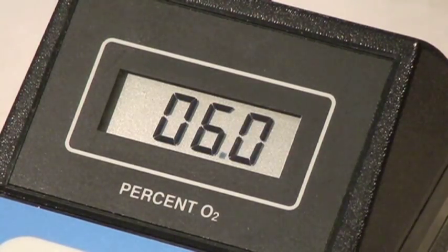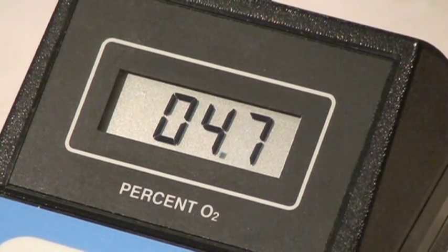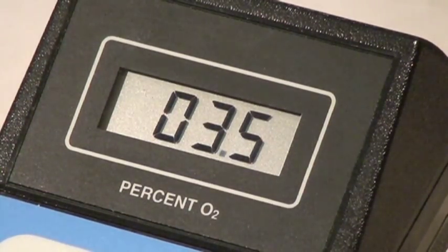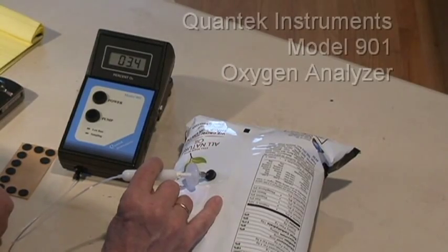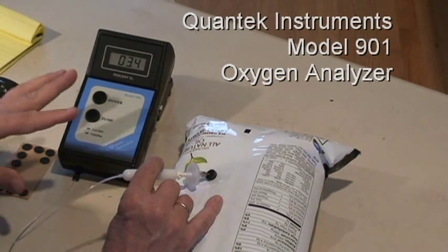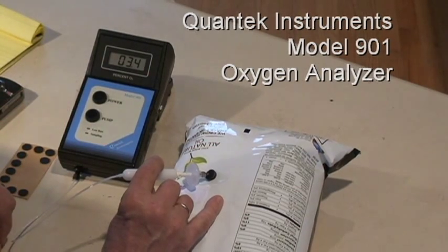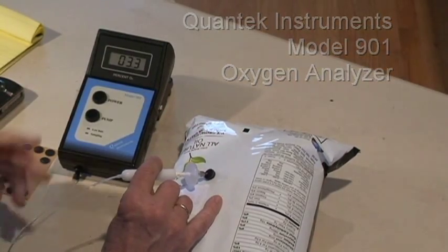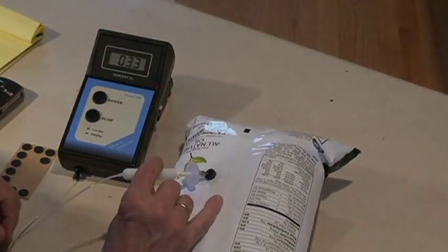The reading is going down: 7, 6, 5, 4. Where the reading stabilizes is the oxygen content in the package. We're at 3.5%, then 3.4% oxygen. So right around 3.4% oxygen, which is what we would expect for a snack food — anywhere between 2 to 4%.